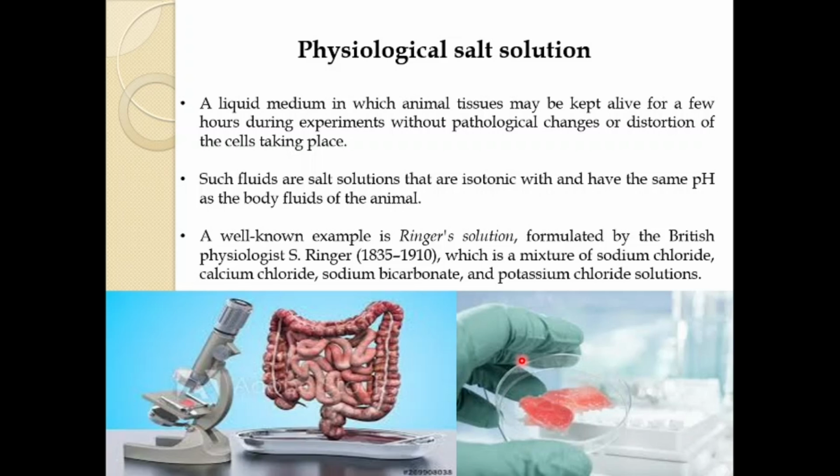And why are we also calling it a salt solution? Because these liquid media are prepared from salts dissolved in distilled water, salts like sodium chloride, calcium chloride, and many others dissolved in distilled water, and you get the physiological salt solution. So these liquid media are known as the physiological salt solution. The reason being, they resemble the same physiology as the fluids inside the living body, and they are prepared from salts dissolved in distilled water. This is the reason we call these liquid media the physiological salt solution.